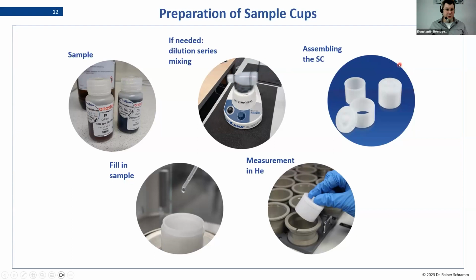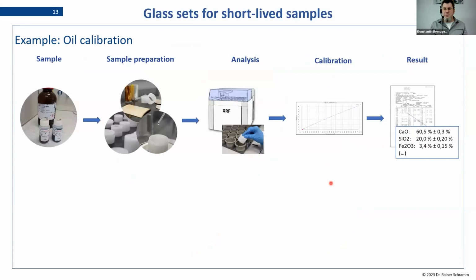We put them in a sample cup, obviously. We then fill a certain amount, and we measure the sample cup in helium. There are a few problems attached to that.